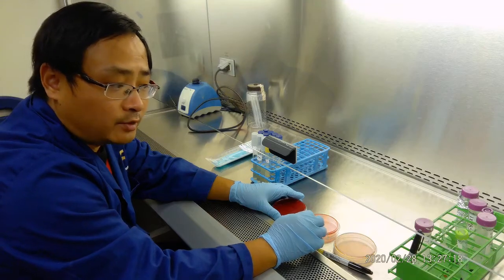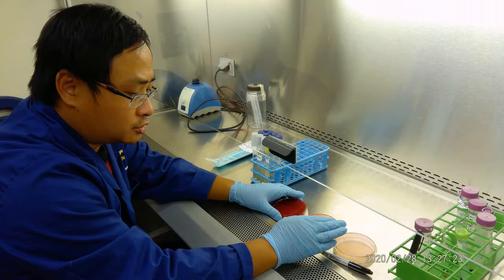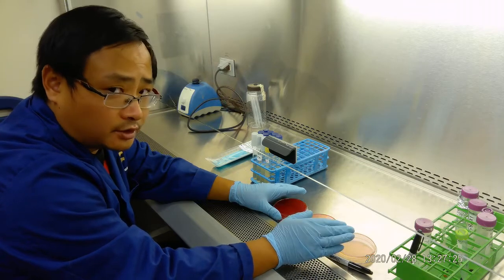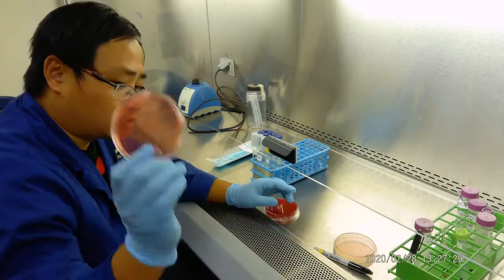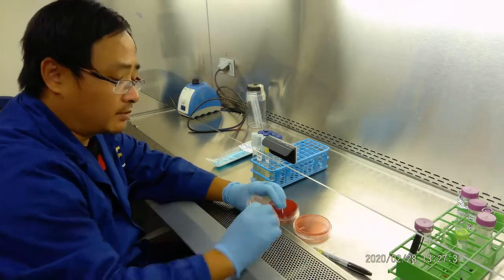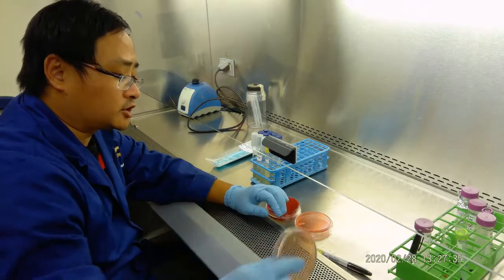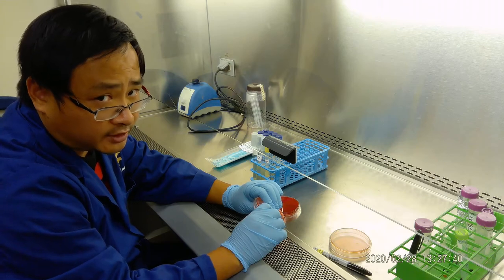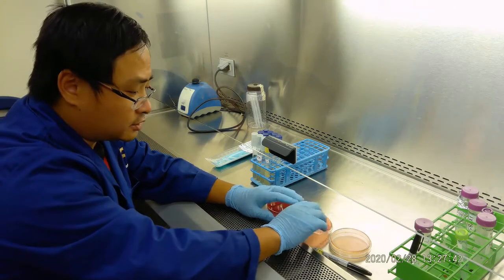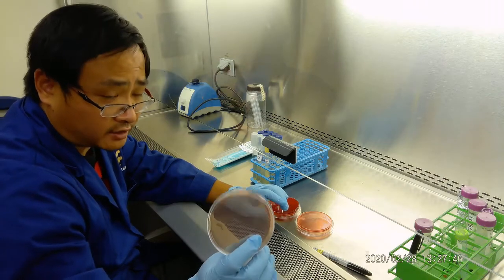So in this lab we will do two jobs. Number one is we will see the bacteria growing on blood agar, mannitol salt agar, and the MacConkey agar. MacConkey agar is a selective media because of its crystal violet, so only gram-negative bacteria will grow. And it is also a differential media because of the lactose fermentation, positive or negative.